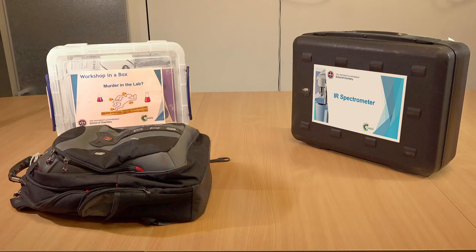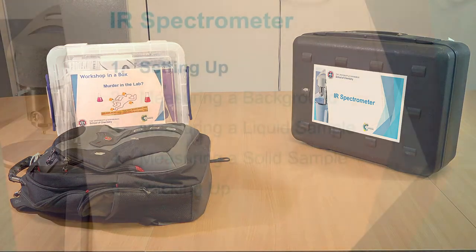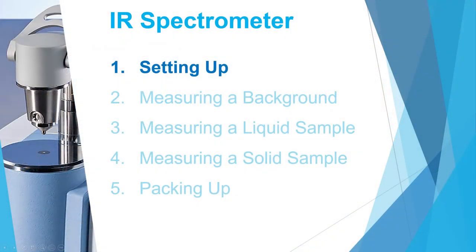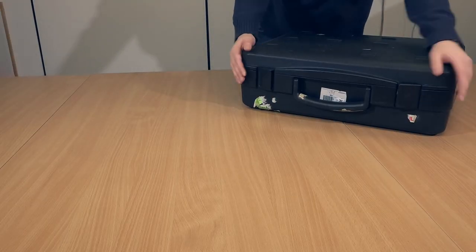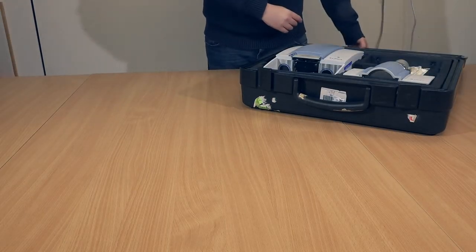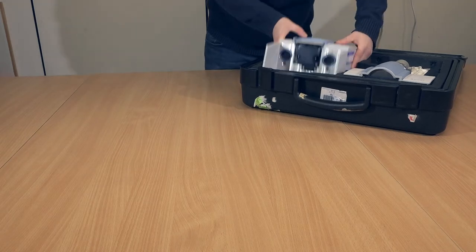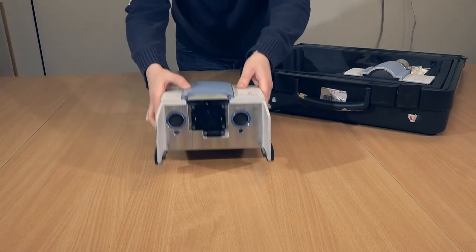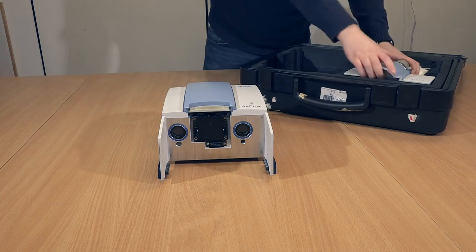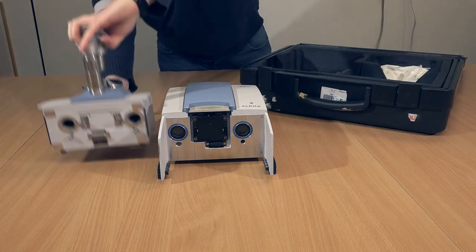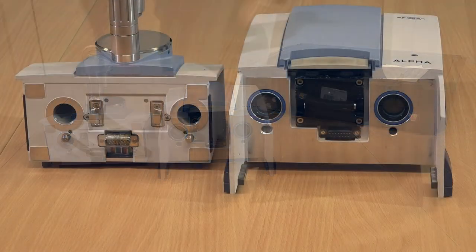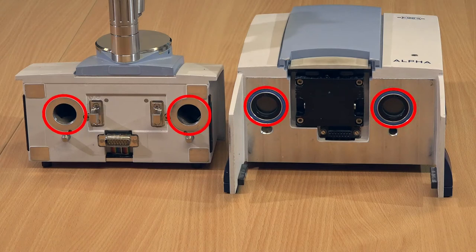Release the clasps as shown here to open the IR spectrometer suitcase. The spectrometer is in two parts. Remove each of them carefully - they are surprisingly heavy. Make sure not to touch the round windows or apertures in each of the two units.